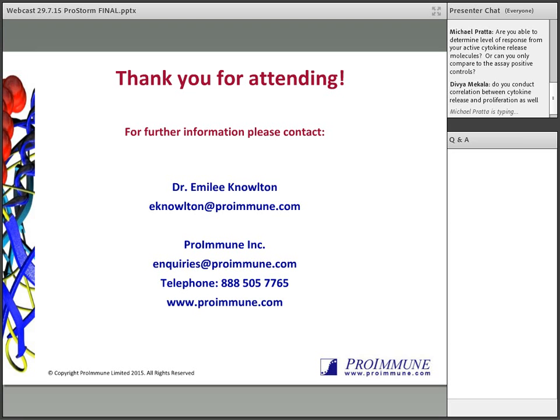Okay, do you conduct correlation between cytokine release and proliferation as well? We do not do that in this particular assay. We do have separate assays to assess this. The cytokines that are released are quantified as a part of ProStorm, and then we do have proliferative assays, so things where we're stimulating monocyte-derived dendritic cells with whole protein and then looking at the CD4 responsiveness to that, or stimulating PBMCs with peptides and looking at CD4 responsiveness to that.